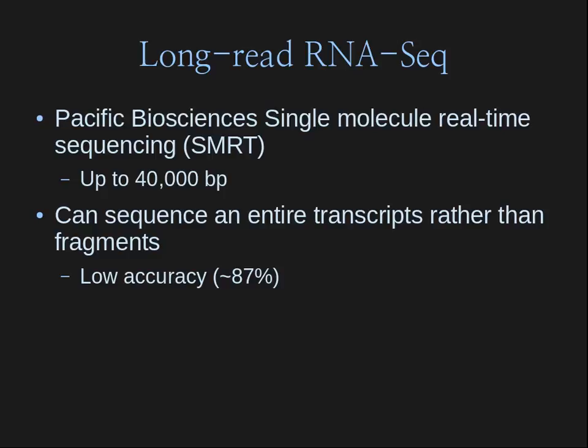But it seems like smart would be more accurate, but maybe shorter. I don't know. That's just what comes into my mind. And actually, every individual read, or every individual base call, is something like 87% accurate. So if you had a stretch of 100 base pairs, only 87% of them would actually be correct, which is really bad for sequencing. This is not that great. But you do need to do multiple reads just to get a single accurate read.